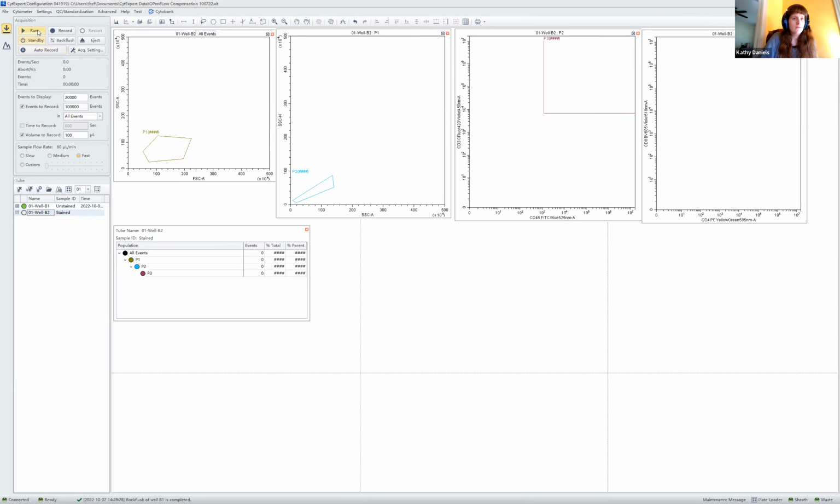Okay. And then we're just going to go ahead and I'm going to change it back to medium. Going to select run. And then we're good to record and see our compensated data.